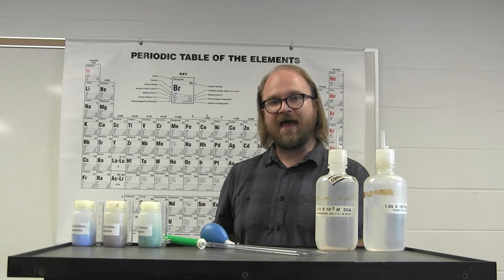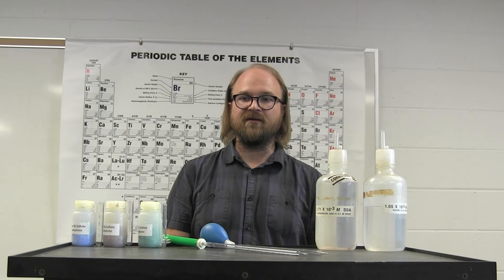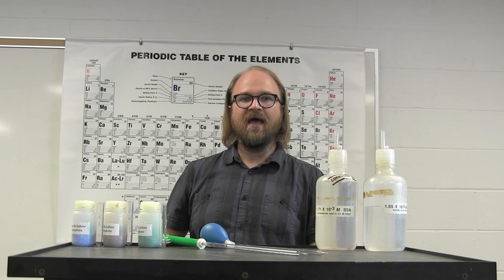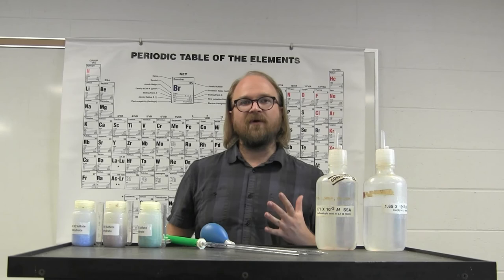You'll then look at what is the absorbance of your three prepared solutions and determine a percent error of that particular measurement. You'll know the theoretical concentration of each one of those ions based on the mass and based on the volume of the material that you weighed out and the solutions that you've measured, and compare that to the measured absorbance. So in the end, you're looking at a lot of different solutions, and hopefully throughout the lab, you're getting a better sense of how to prepare different types of solutions and how to utilize them in chemistry.